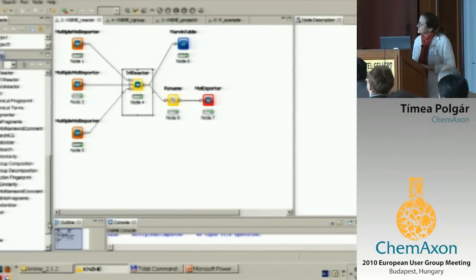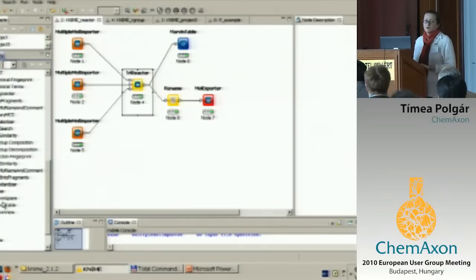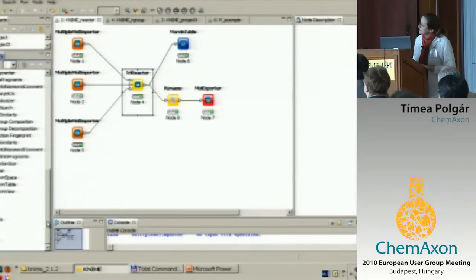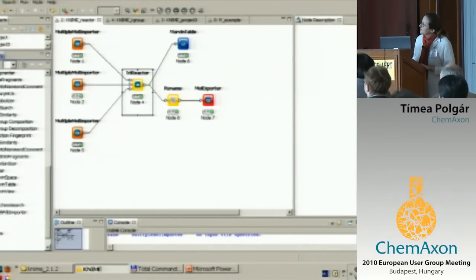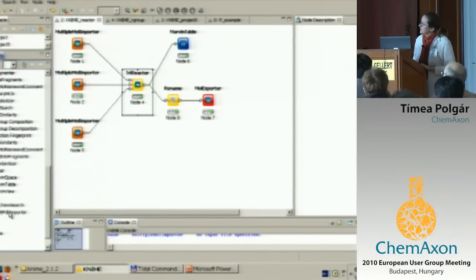We have three nodes you don't need licenses for. These are the Marvin nodes, so you can visualize your output using them. And the last one is the web bundle, so you can also do searches in PubChem or in the PDB database.